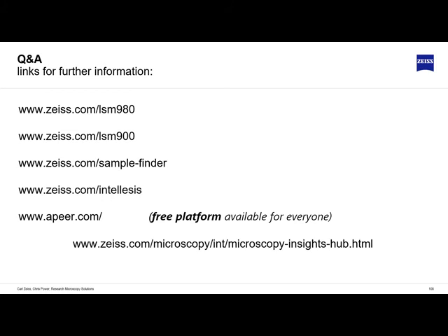Yeah, the attendee says, okay, I'll reformulate. Maybe all scientists would be wrong because they use all the same AI platform. Yeah, I see what you mean. Yes, I mean if there is a fundamental mistake in the AI, then yeah, that would be wrong. It would be if you were running your data incorrectly. But what you're trying to do with the AI, and where this AI comes in particular use, is it's really about taking a process which is extremely manual and automating it.